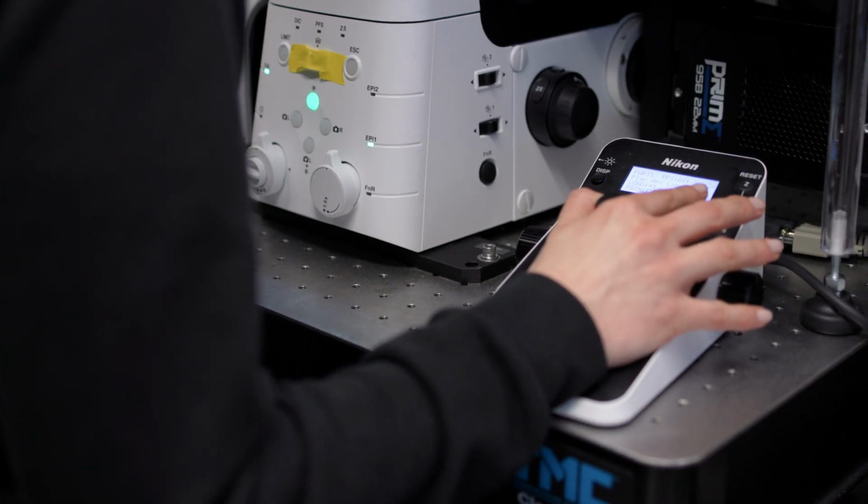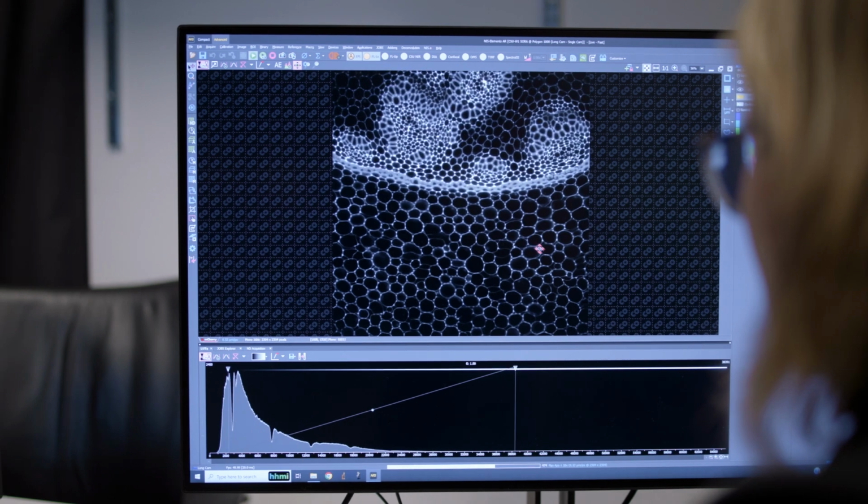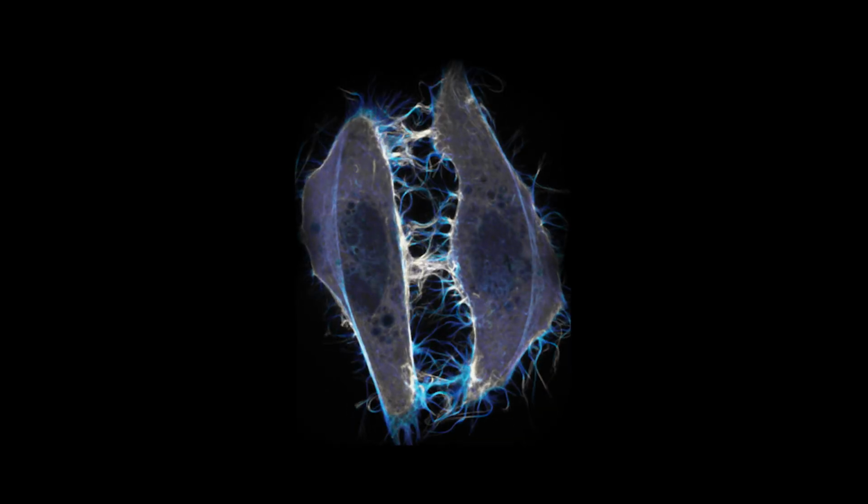A blurry image is never good for microscopy, so we have to figure out a way to restrict our focus only to a single plane. And that is when we turn to confocal microscopes, which allow biologists to slice the sample into thin sections, which at the end we can compile all those images together digitally.